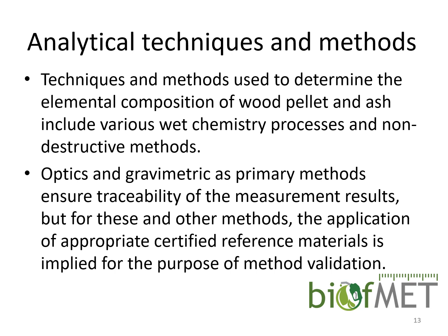And it's usually the role of metrological institutes or other types of reference laboratories in any field to develop and confirm these primary methods, and to provide traceability to other routine laboratories, to the second level.